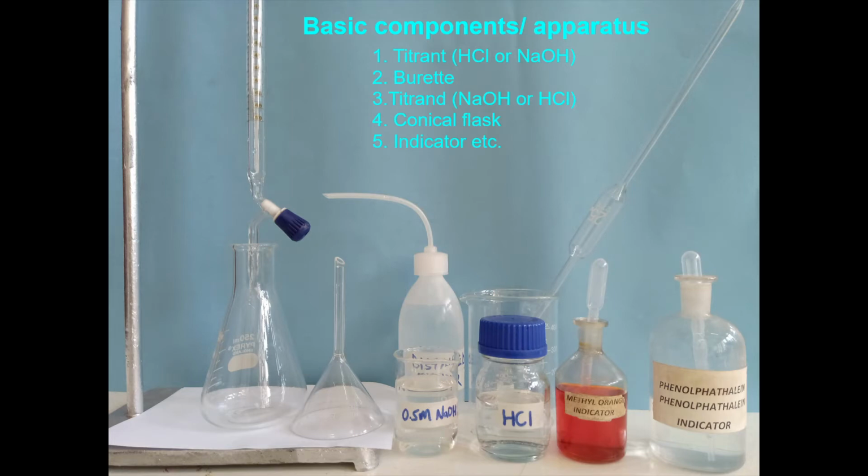The basic components and apparatus of a titration include the titrant, which is filled in the burette, the titrand, measured by pipette and added to a conical flask, and an indicator where applicable. Titrations with no suitable indicator are followed by measuring the change in pH, temperature, conductivity, etc.